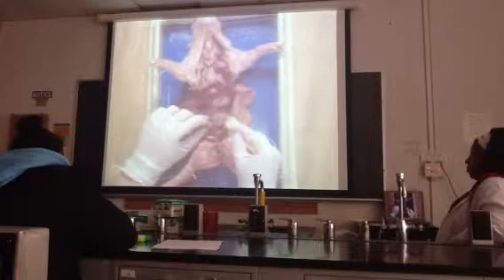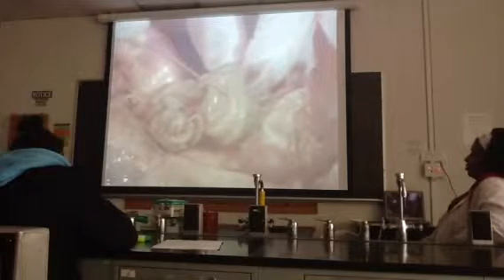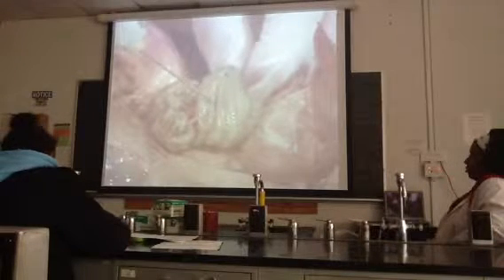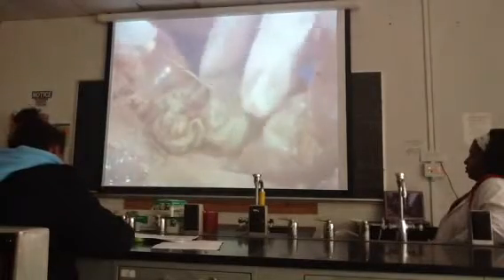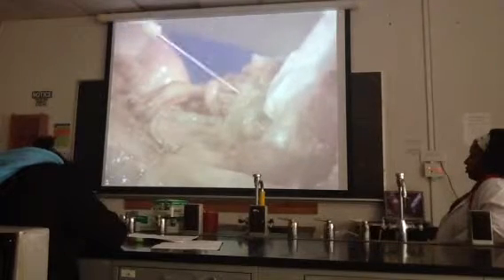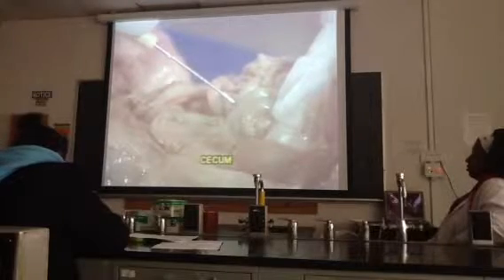On this side, we see a compact coiled structure, which is called the large intestine or colon. It functions in storing the undigested food, which is also known as solid waste, and absorbing excess water. If we lift the large intestine, we can see a pouch where the small intestine and the large intestine join. This pouch is referred to as the cecum.